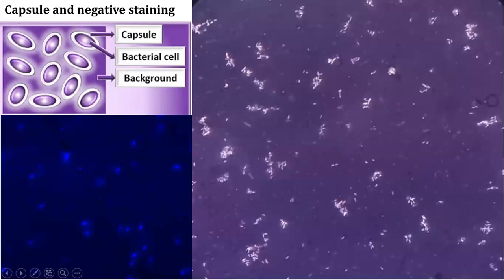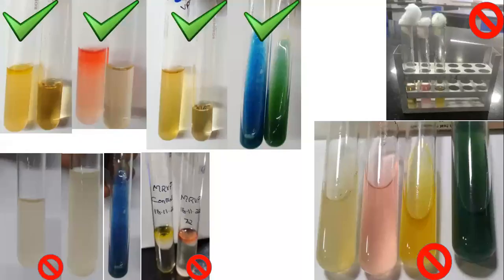Once you have studied the morphology, I would say you can also include motility here. Once you are done with the anatomy of the cell, you can get into the biochemical characteristics. The first things usually people do for Enterobacteriaceae are IMViC: indole, Voges-Proskauer, methyl red, and citrate utilization test. But many people will argue that when you are going for environmental samples, IMViC may not be necessary. But I would say collect as much information as possible about your bacteria for species diagnosis. Do not constrain yourself by thinking IMViC is only for enterobacteria.